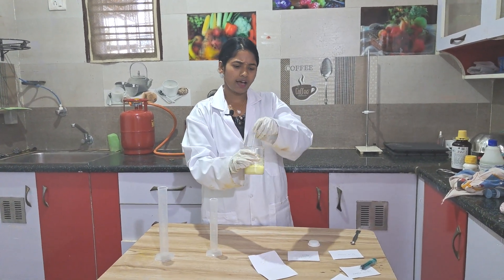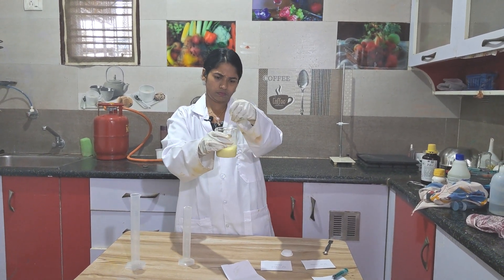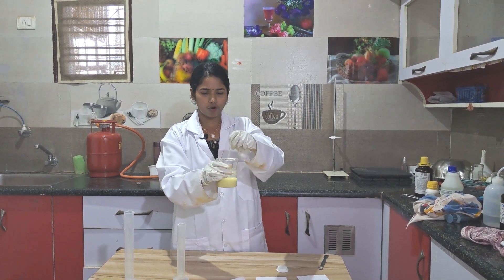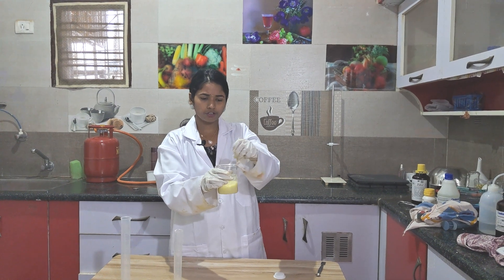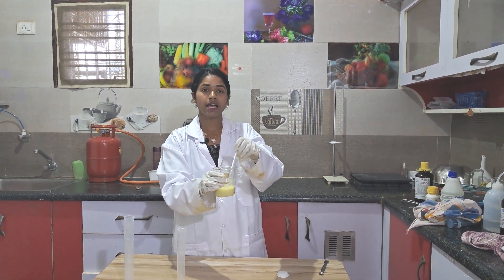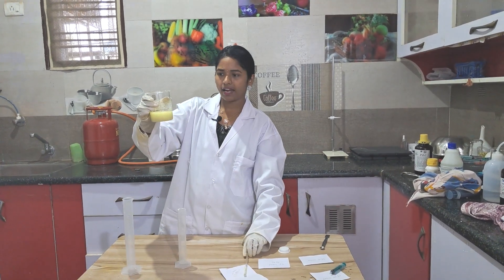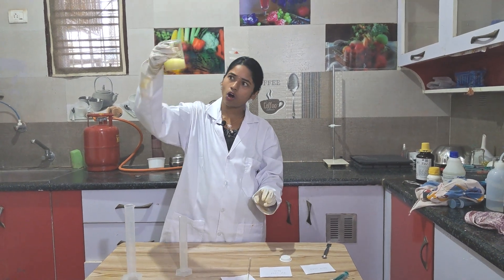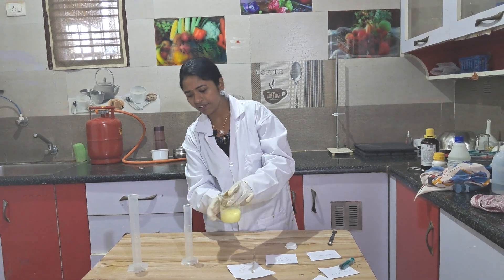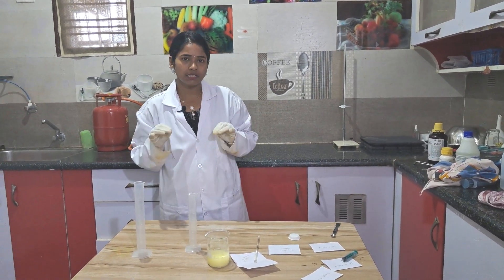So what is the iodiform test? First, we dissolved acetone in 30 ml of water — 1.5 ml of acetone — then added 4.2 grams of potassium iodide and 50 ml of sodium hypochlorite. We got a yellow color solution. Leave this solution for some time and the precipitate will settle down.